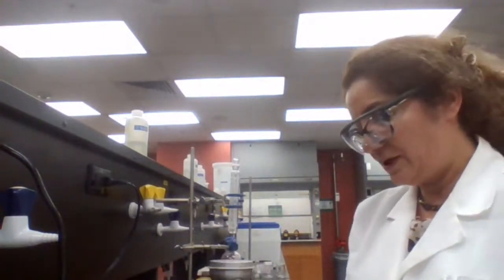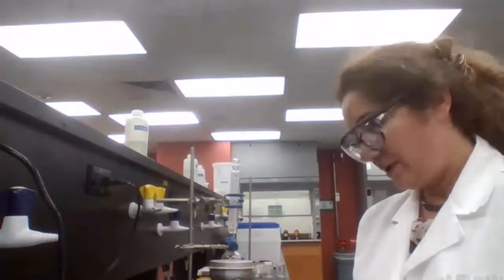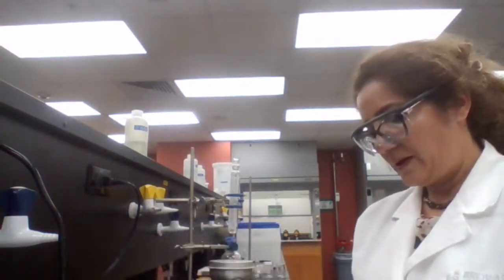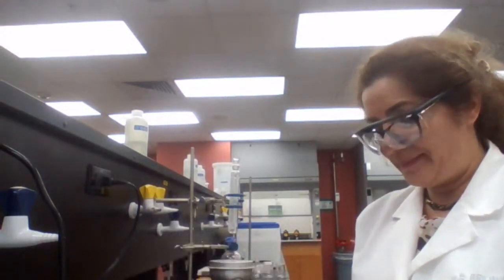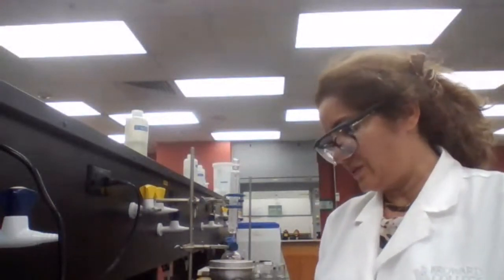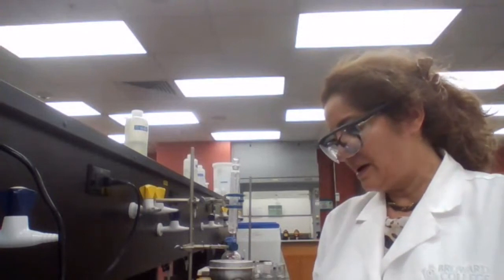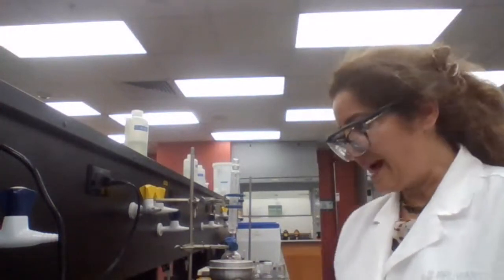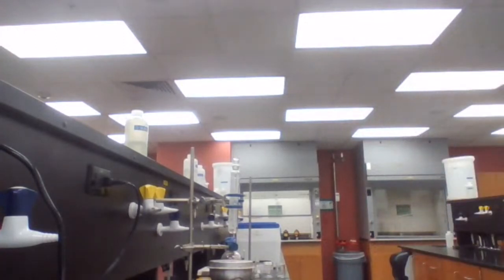During the procedure, during the extraction, what is extraction? Did you review extraction from previous experiments, from either experiment 4 or from the lab techniques for extraction? How is extraction applied in this experiment? Why are we using extraction? When we do extraction, what is actually happening? We are using ether as the extraction solvent, and our product is methyl benzoate. What is happening in extraction? Do you remember from organic one?